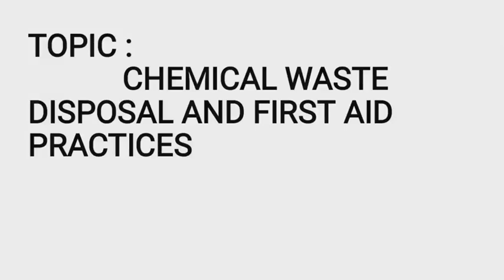Myself Muqaddas Fatma, and I am going to discuss chemical waste disposal and first aid practices. First of all, we have to learn what chemical waste is, how many types there are, how to dispose of them, and how to maintain a safe and clean working environment.